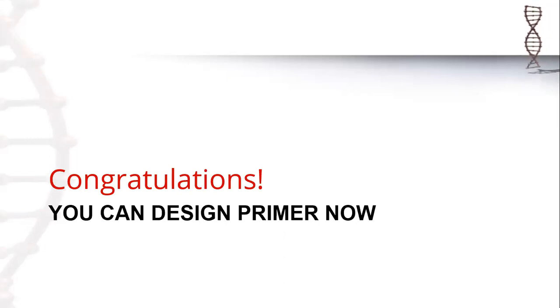At the end of this lecture, I hope that you can design the primer now. Congratulations, you can design the primers now by utilizing these guidelines. So now we can go for some basic know-how about these tools that are available online, easy for new users, for designing the primer according to these conditions using the default parameters. So we can go from here.